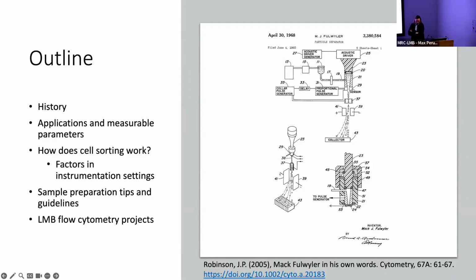Basically, the Coulter counter enumerated sized particles suspended in electrolytes, and they were able to then read these sized particles pulled through a glass tube. And essentially, they were able to count cells. It was a very early instrumentation to count cells.